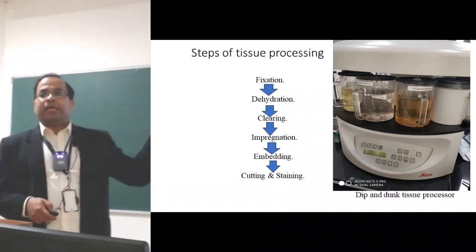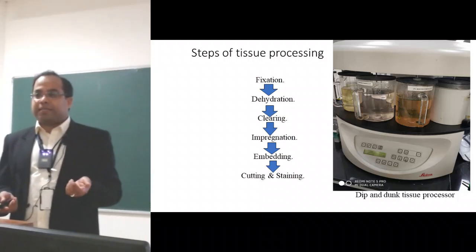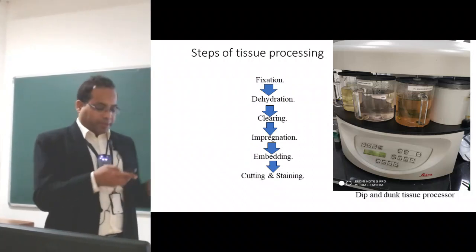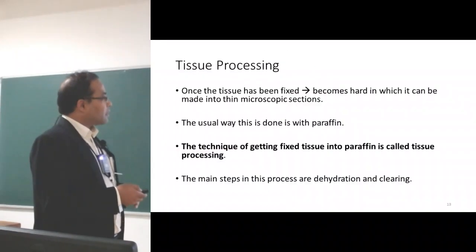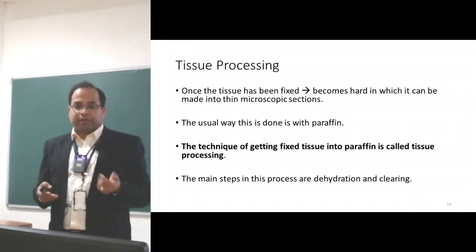This is only feasible for 150 to 200 cassettes in a particular day. But in a center like Tata Medical Center, we have around 350 to 400 cassettes per day, so this is suboptimal. So we have another, bigger processor which can handle a much bigger load.